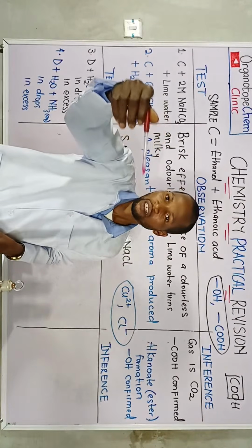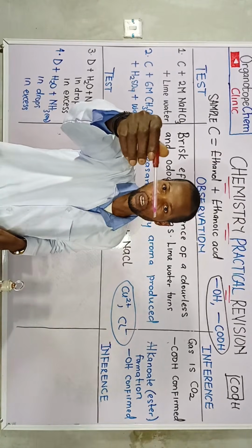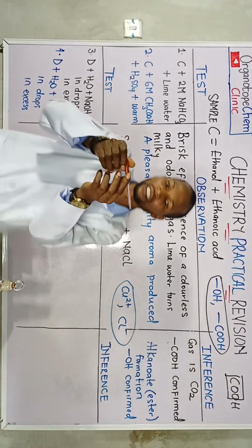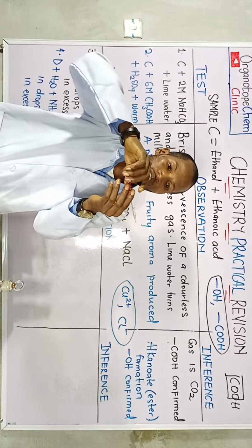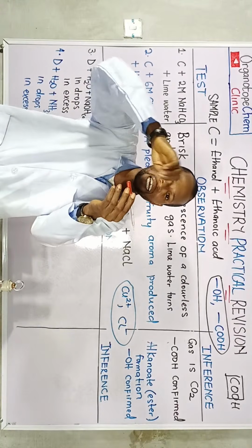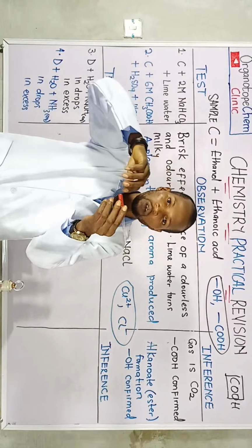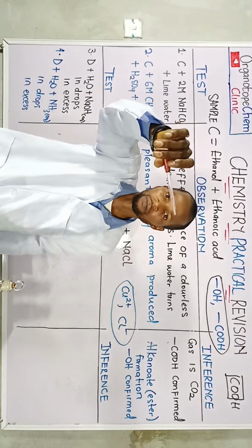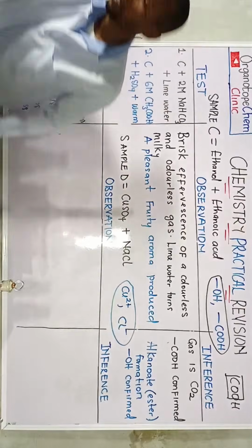You have the dropper having a colored or pink coloration. Is it an acid or a base that is in it? When you have sodium hydroxide with this, sodium hydroxide has actually interacted with what? I think there is phenolphthalein in this solution. There is phenolphthalein in this, okay?